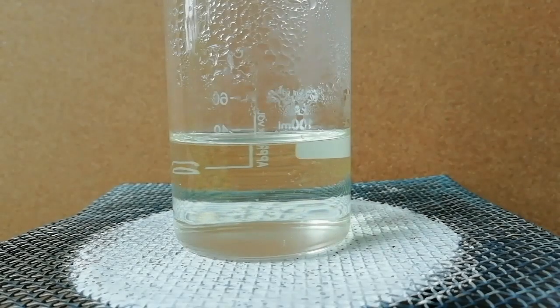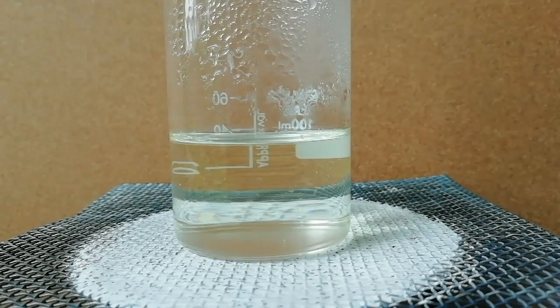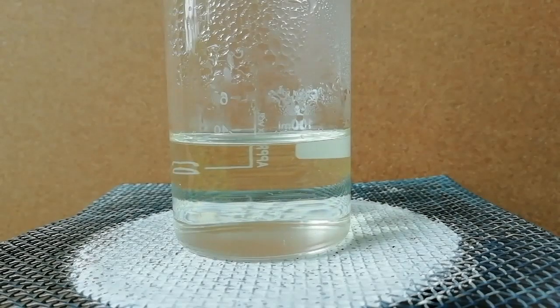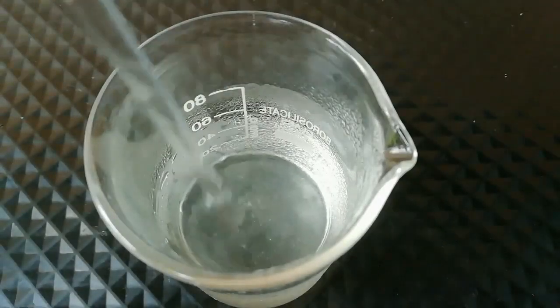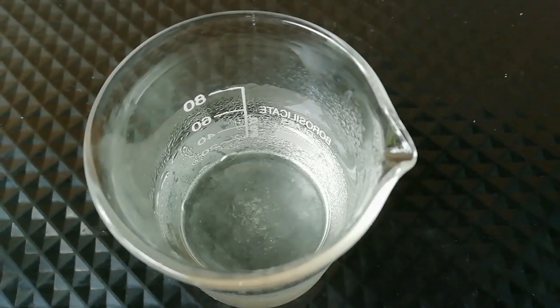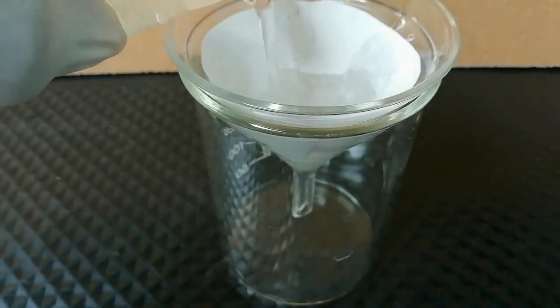Now you can see some potassium iodate is floating in the mixture. Potassium iodate solubility in water is very low, therefore we can remove it by cooling the solution. Then I stopped the heating and cooled down the mixture to 0 Celsius, then I filtered the solution to remove potassium iodate.